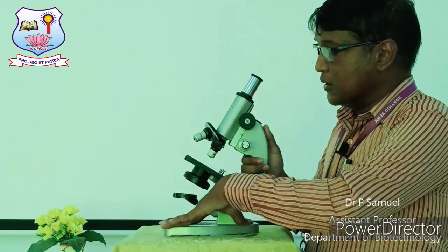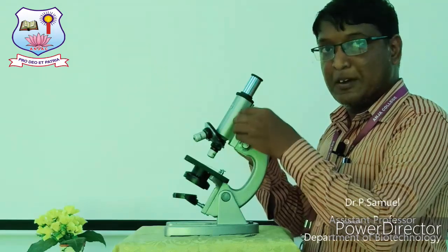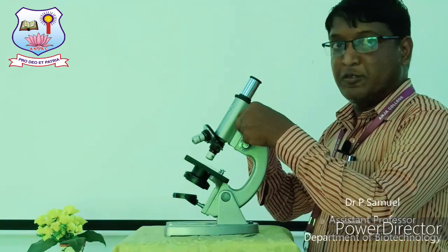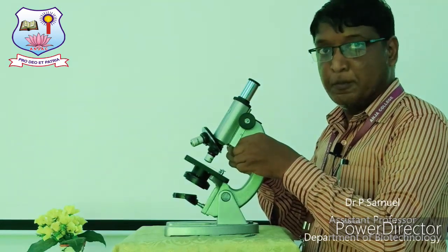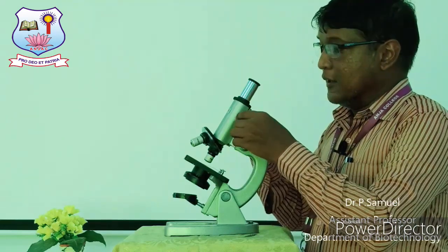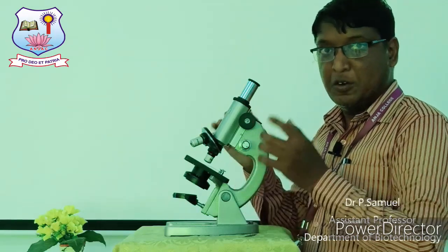Another important thing with respect to the microscope is how to dismantle this area. Whenever you are handling the microscope, use both of your hands. This is how you have to scroll your coarse adjustment knob, and this is how you have to scroll your fine adjustment knob. Don't use a single hand, because this will definitely spoil the smoothness of the axis, right?